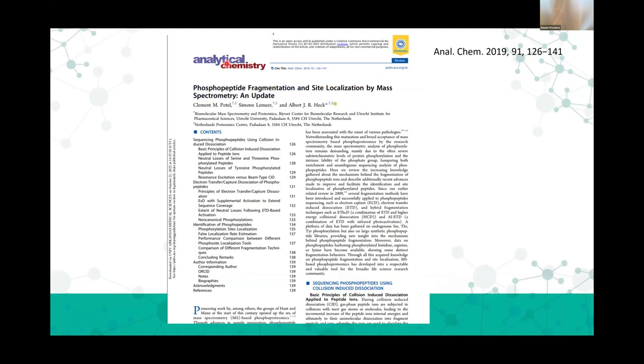After you identify a phosphopeptide, it has your sites in the same conventional pattern. Do you have a way to do in vitro validation, such as getting the peptide synthesized by someone with the phosphate added? Is any company working with proteomics to validate the sites? You can, yeah, you can have a peptide made with a phosphorylation.